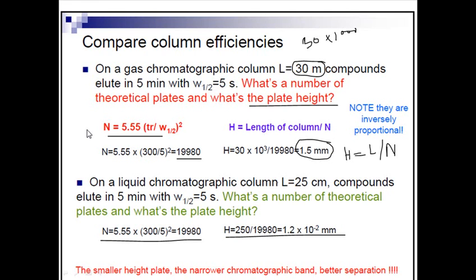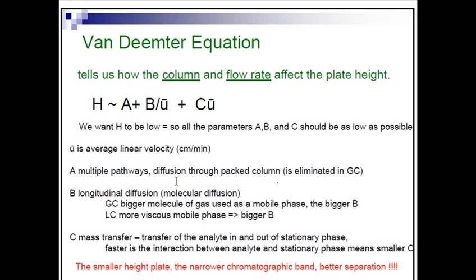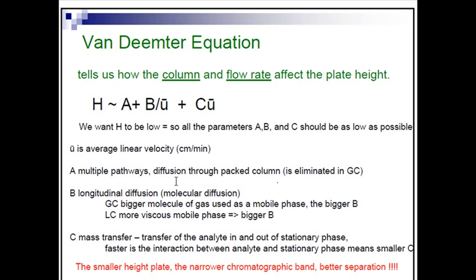By doing this, we can establish and arrange a whole system of data. Okay, so it is the Van Deemter equation. We'll talk about this in later lectures.